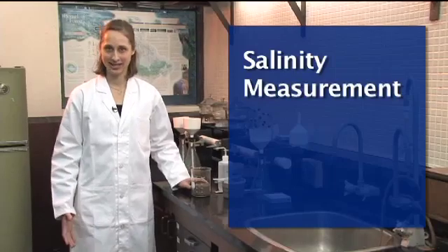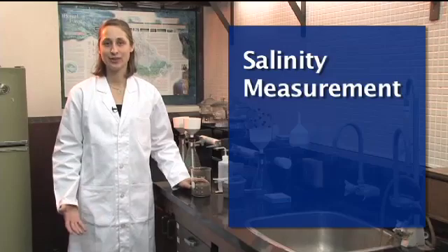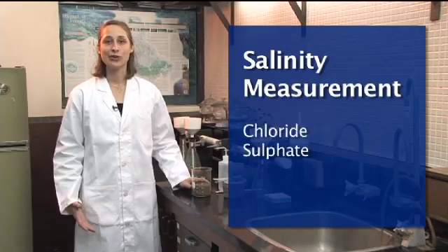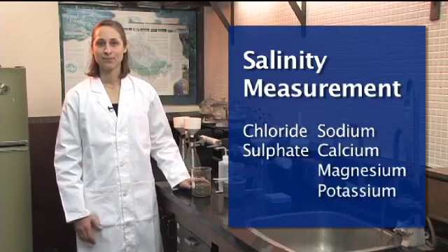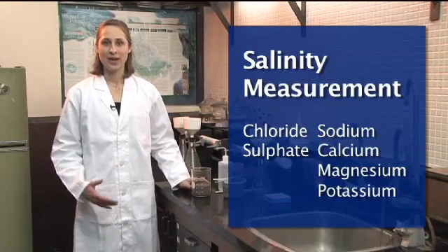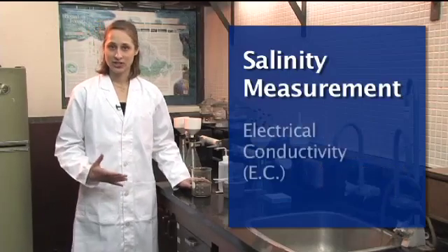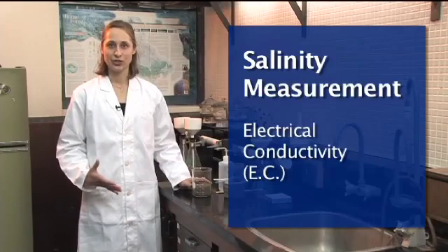We're going to look at how to do a salinity measurement. Salinity, simply put, is just the amount of salt in the soil — mostly chlorides and sulfates of sodium, calcium, magnesium, and potassium. Pure water does not conduct electricity very well, but as you dissolve more salt in it, it does conduct electricity. So what we actually measure is the electrical conductivity, sometimes called the EC for short.